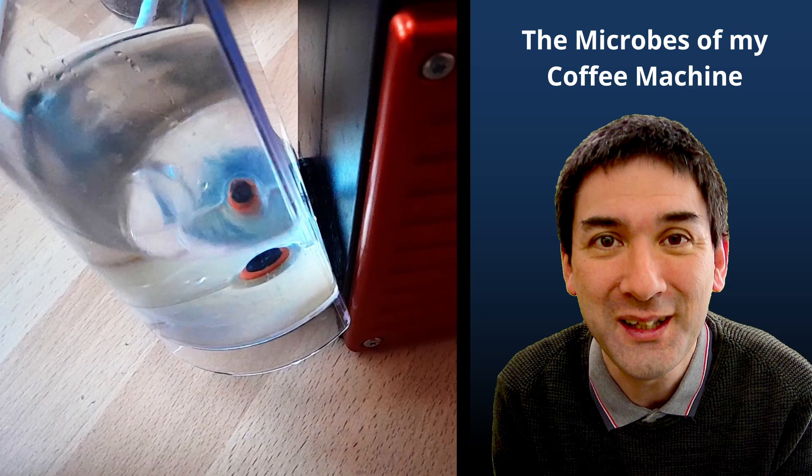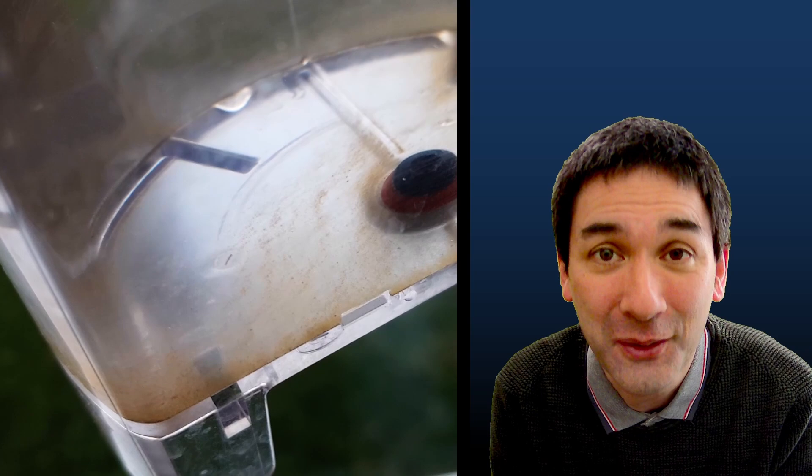I found some interesting microorganisms growing inside my coffee machine, specifically in the water tank of the coffee machine, and today I want to put them under the microscope. Hi, hello and welcome, microbe hunter here.